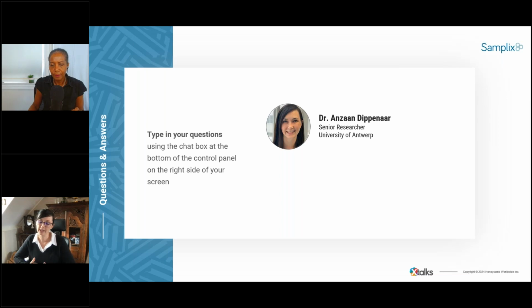So the advantage of moving to ONT is that the instrument has a very low capital cost. The instrument is also portable, so it's very easy to move it even to the field. And here we're really thinking about decentralization, so it makes it very useful to take sequencing to the clinics, as we say. Another advantage of the ONT platform is that the longer reads it produces have advantages, especially for MTB with its very repetitive genome.